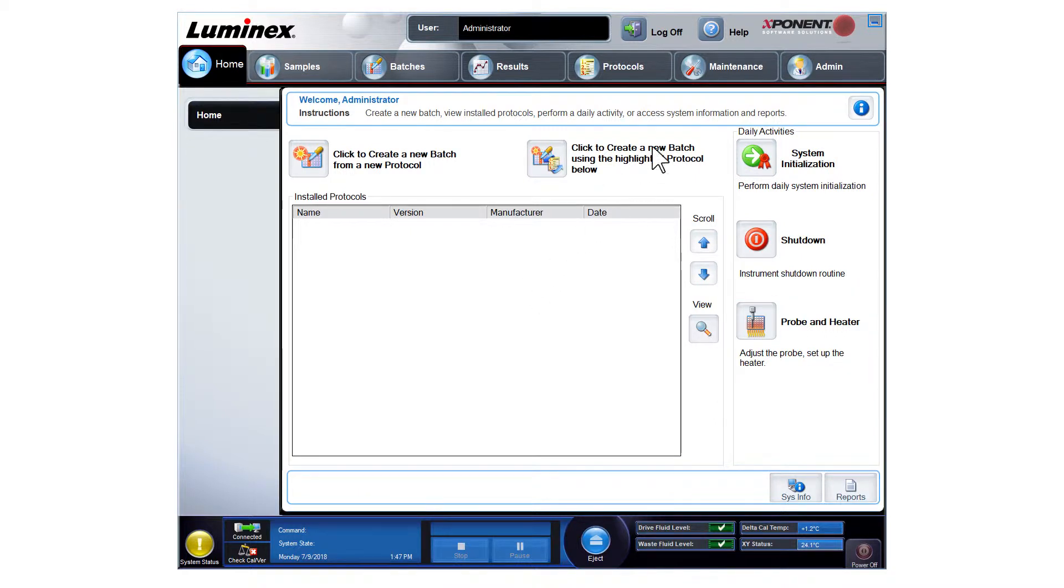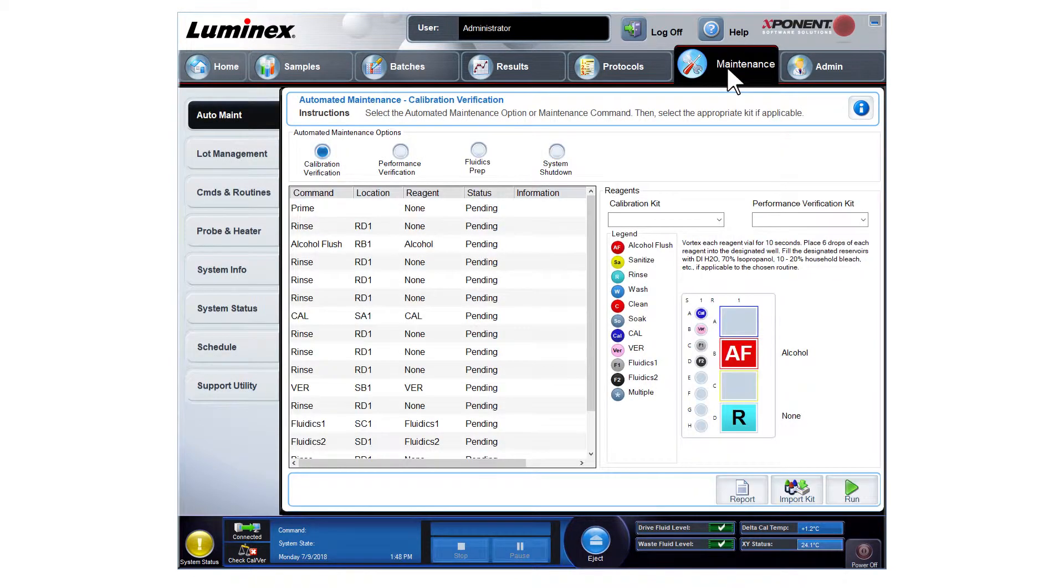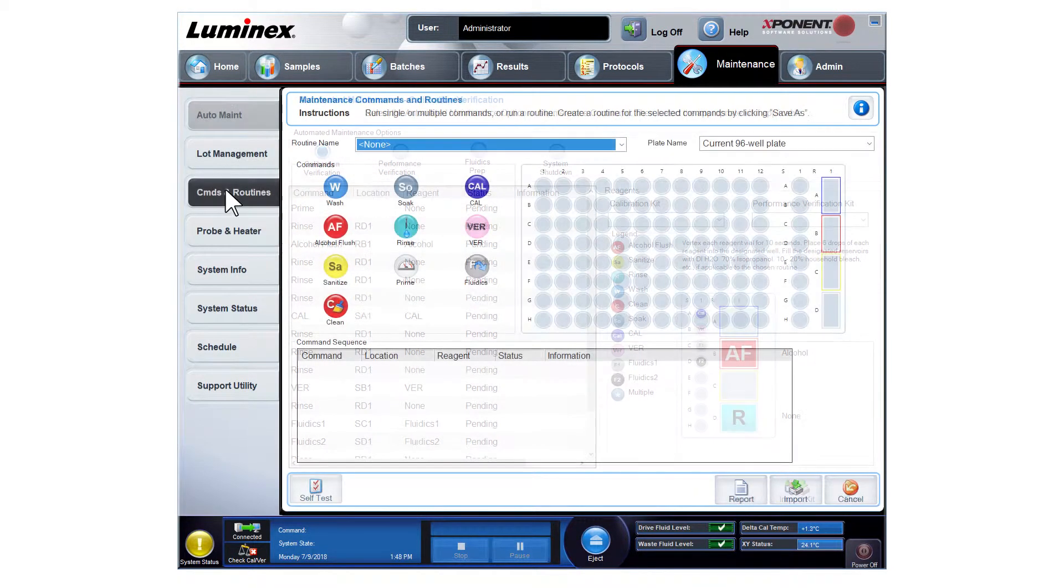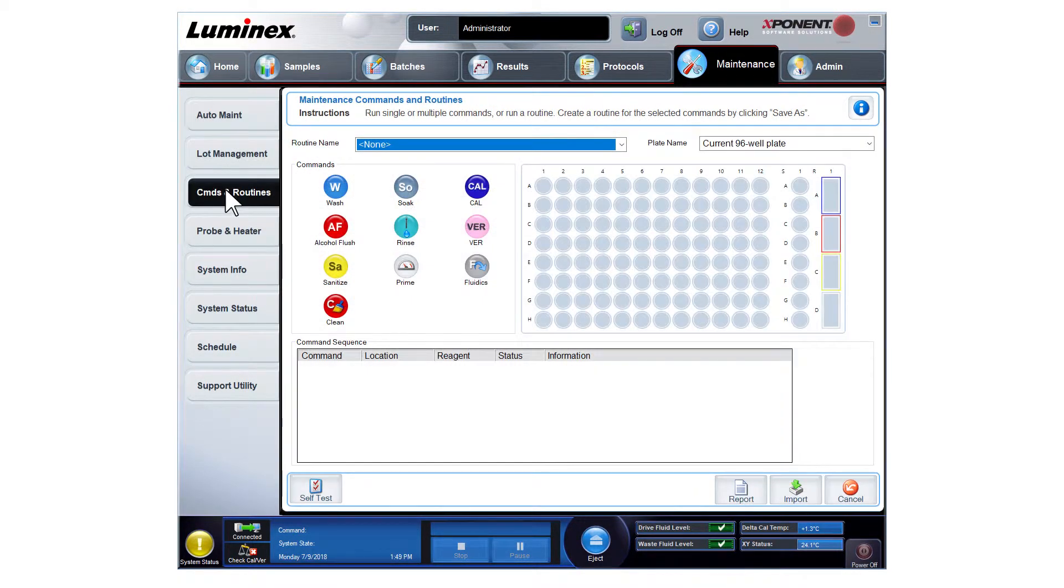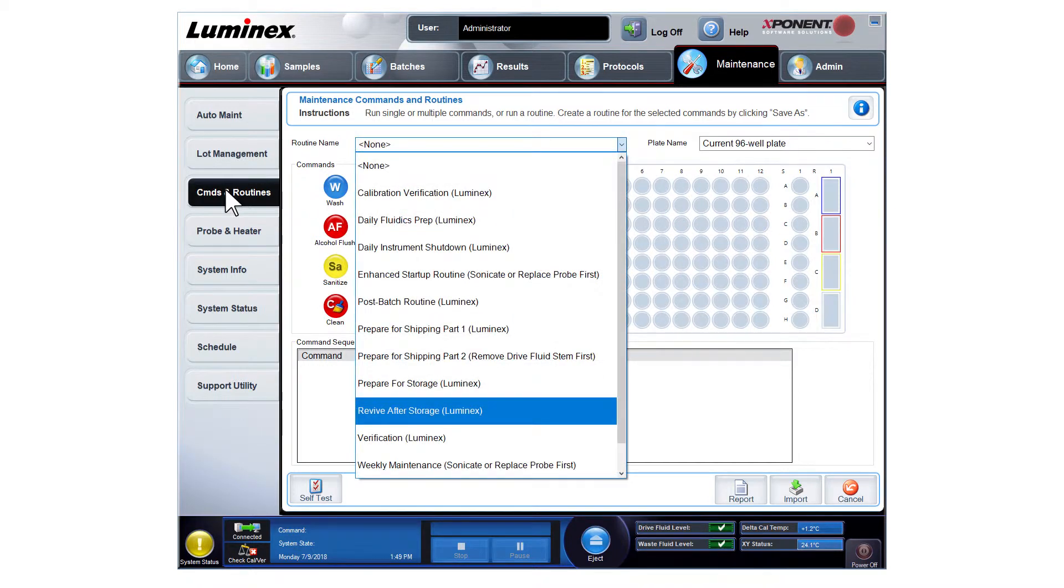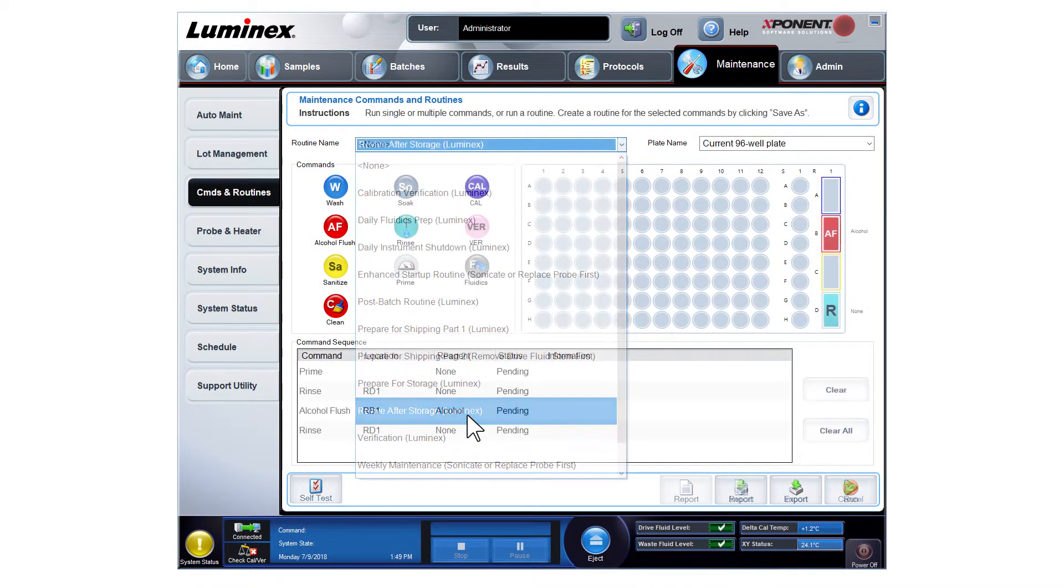Next, navigate to the Maintenance page and go to the Commands and Routines tab. From the Routine Name dropdown, select Revive After Storage Luminex.